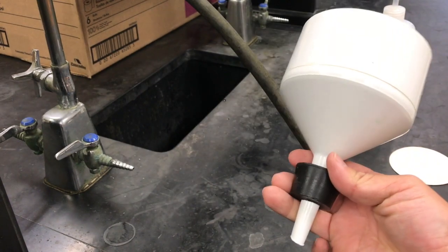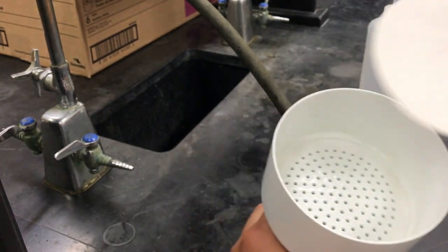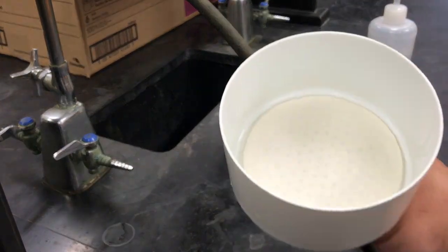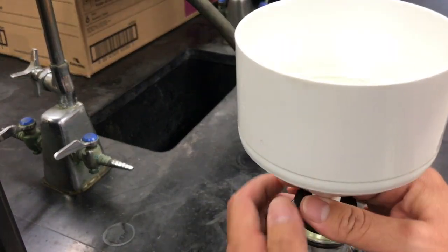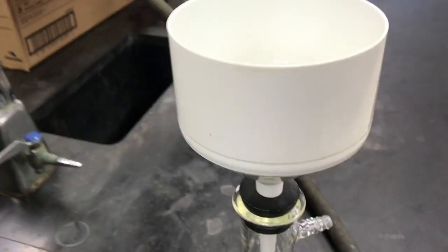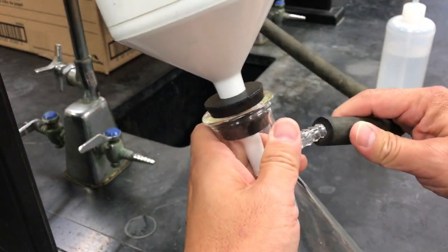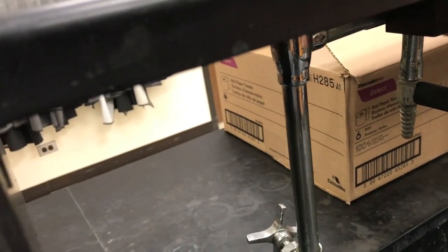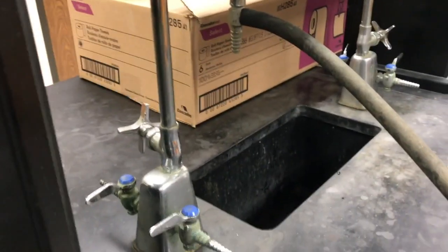This is called a Buchner funnel, and the whole purpose of this is to use filter paper that we just weighed to pour a solution that has some solids in it and filter out the solids. We use the Buchner funnel with a suction flask, which is just an Erlenmeyer flask that's got a side arm here. So we fit the funnel into the flask, like so. And we connect the flask to a hose, which is a suction line. And the suction line comes from the negative pressure of rushing water as water flows through the faucet. Now this is going to make a little bit of a mess and the whole countertop's going to get wet, but that's what paper towels are for.